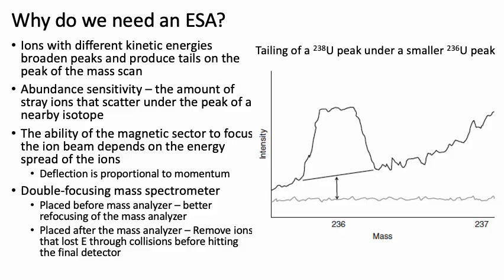So in both ways, the end product is similar, and people argue about whether it's better to have the electrostatic analyzer before or after your mass analyzer. But they produce similar sensitivity results in the end in your ability to measure isotopes.